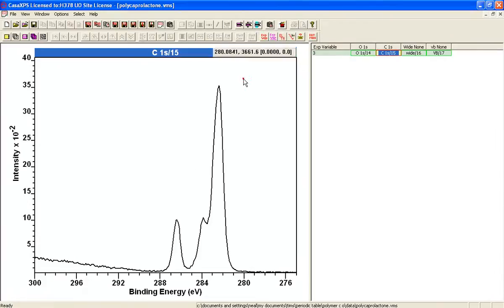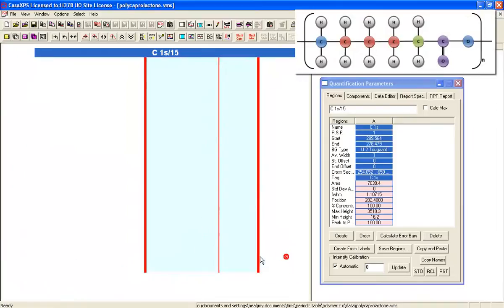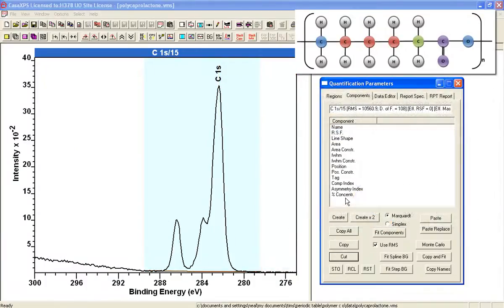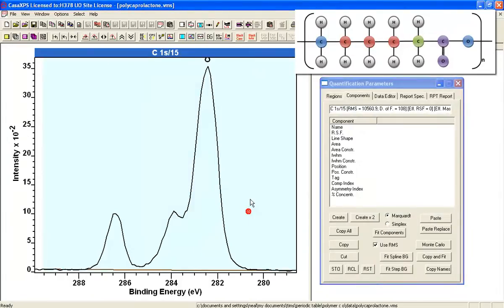So we're going to create a peak model. We'll begin by adding a region to the carbon 1s, so now create a set of peaks and there should be in theory four peaks beneath this envelope.